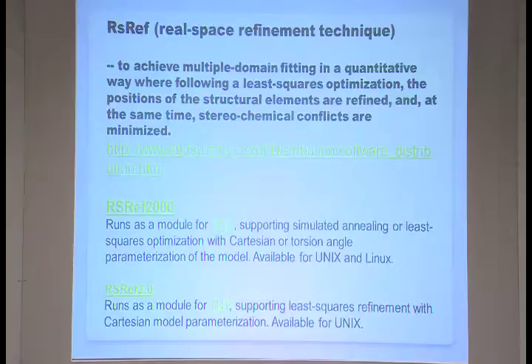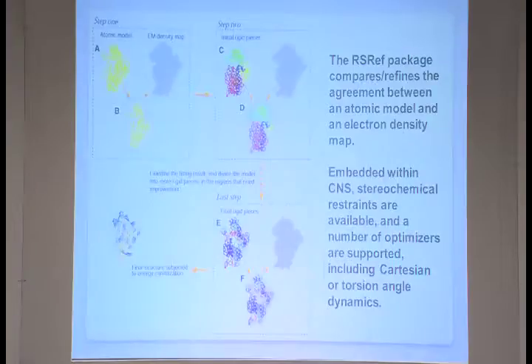What the method actually uses is fitting of your crystal structure. It's a big crystal structure in different pieces, many rigid bodies. First maybe a larger cut of the structure, and then once it fits for some rounds, you can go to smaller rigid pieces.